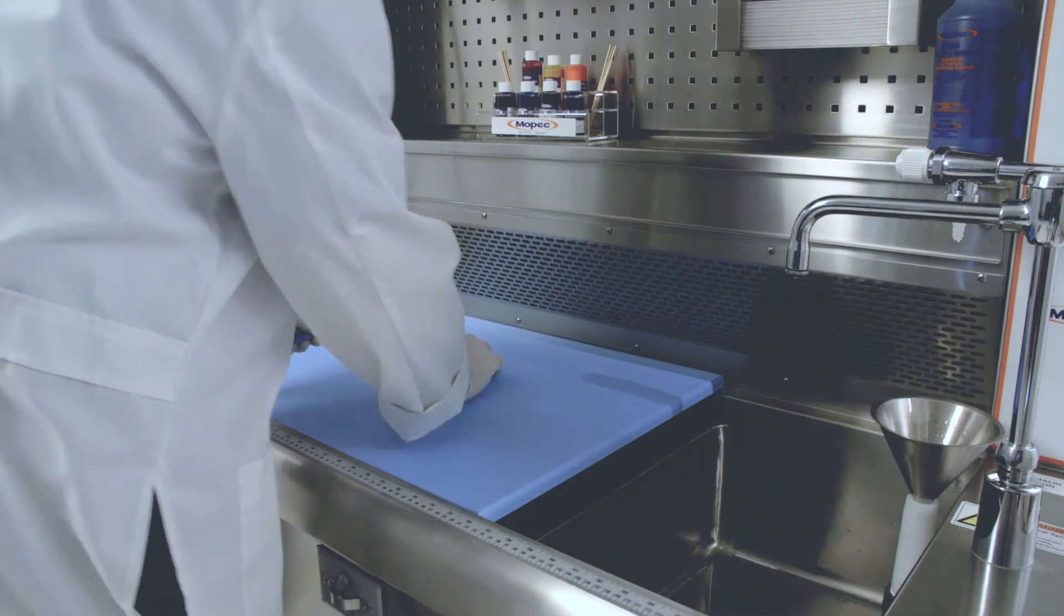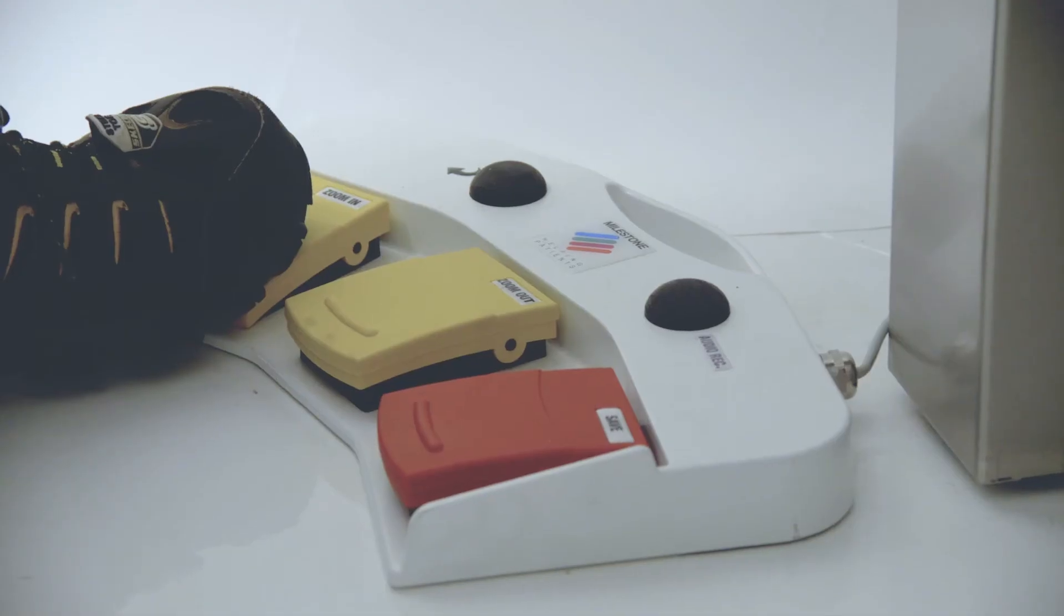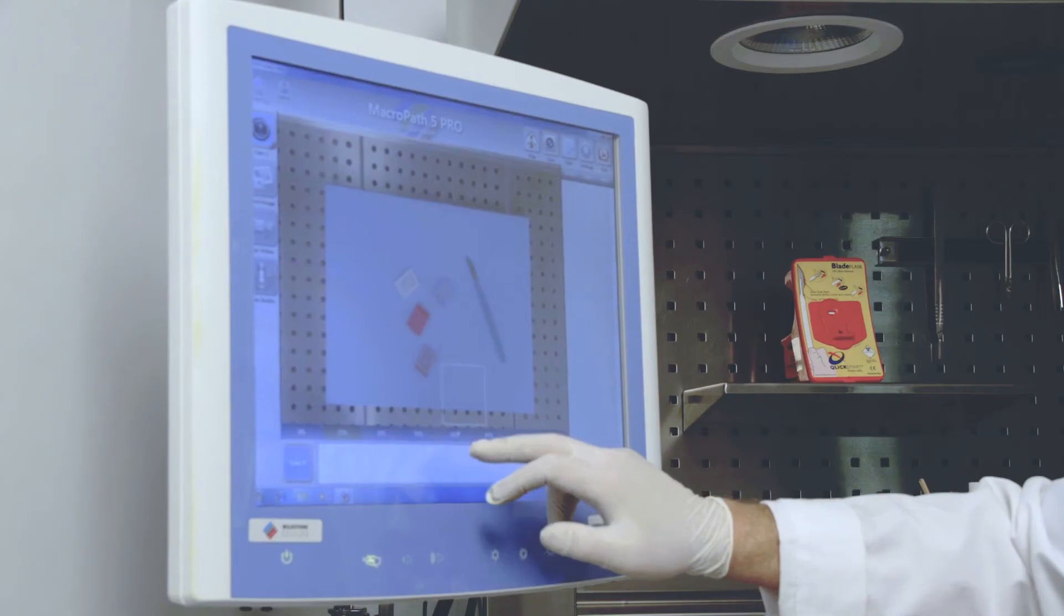User workflow and efficiency is improved by eliminating the need to transfer specimens to a separate imaging station, saving time and valuable lab space.